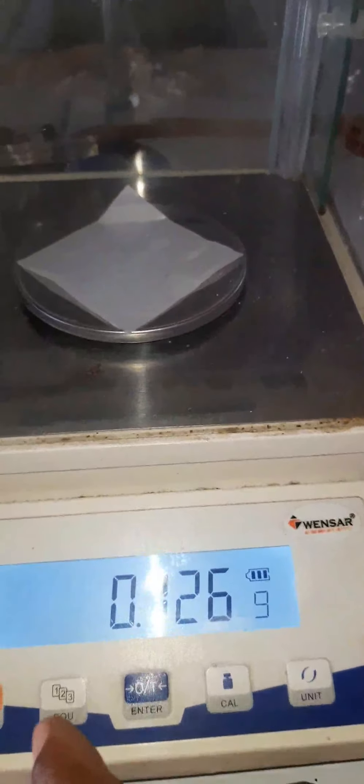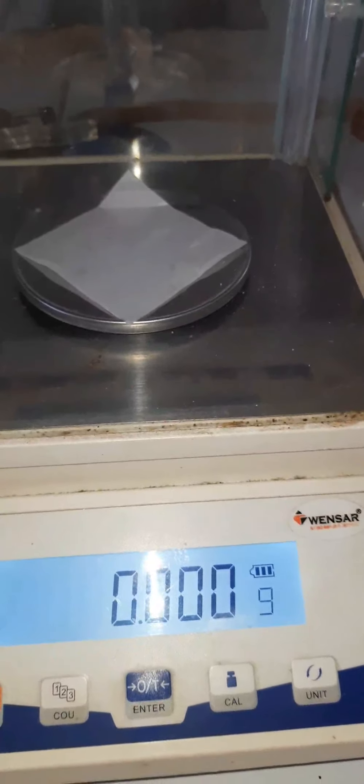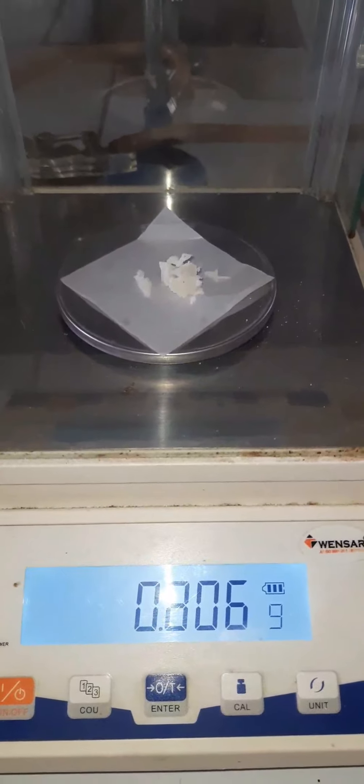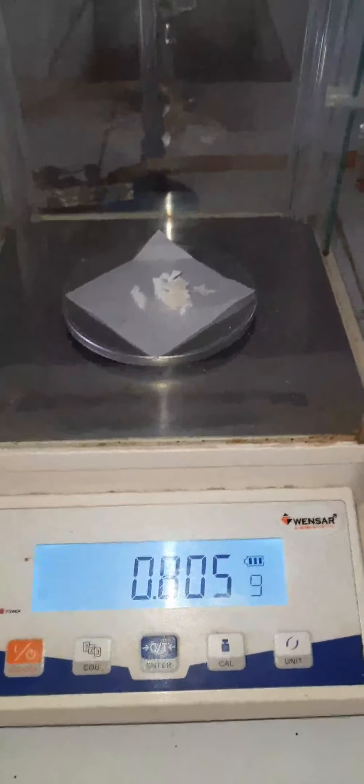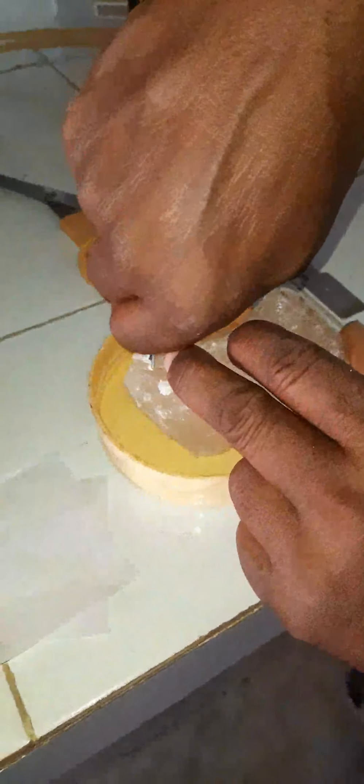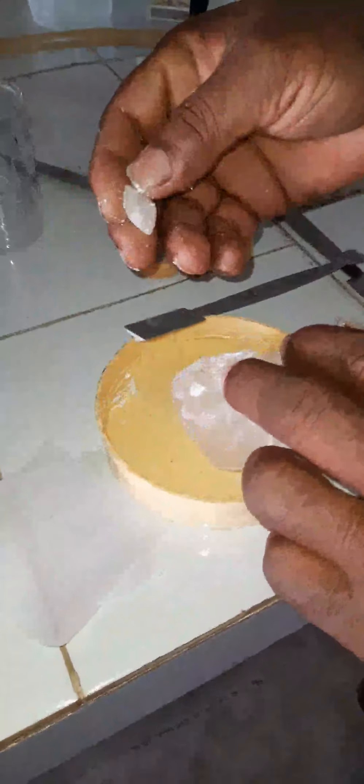First, the white beeswax is taken for weighing on the electronic balance. The white beeswax was weighed and is about 0.8 grams. Now the hard paraffin will be weighed on the balance. The amount is 1.7 grams.